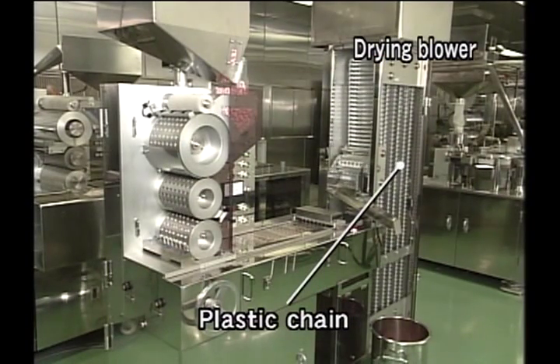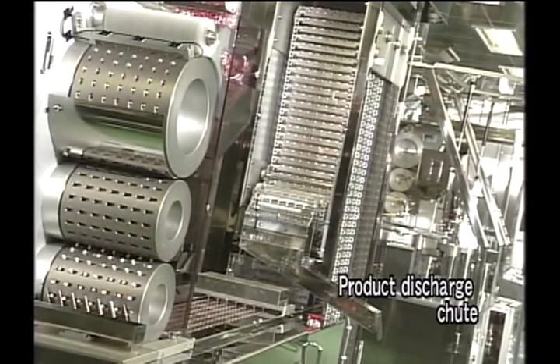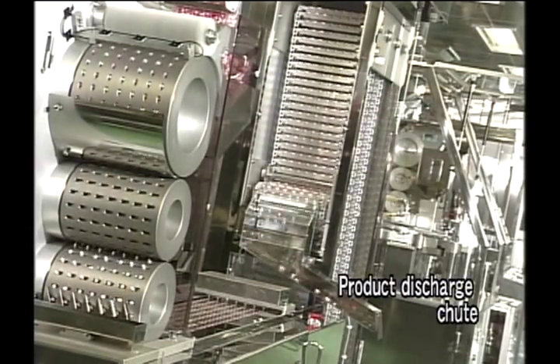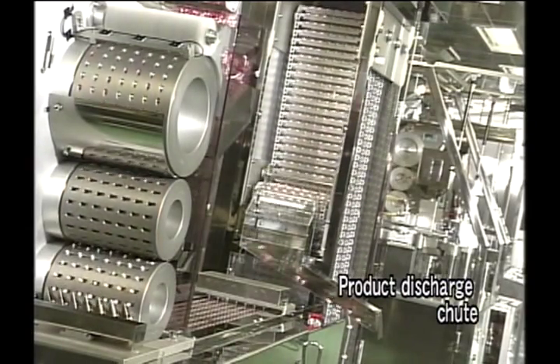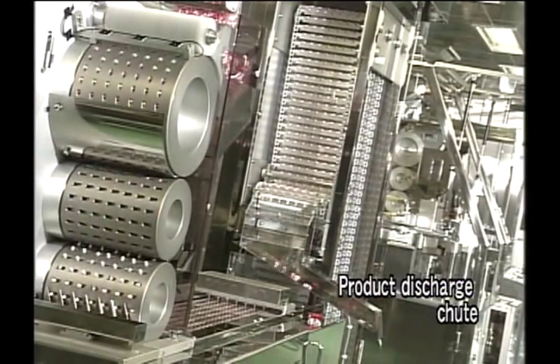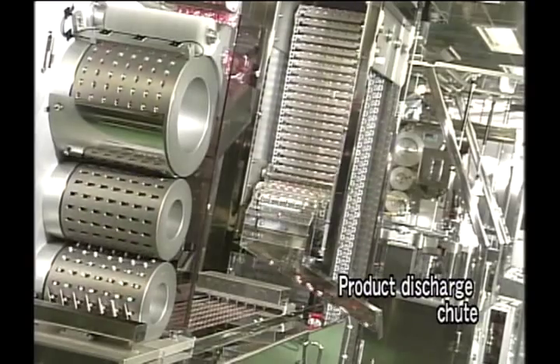This machine makes it possible to manufacture drug products that have a superior bioavailability. For example, by liquefying a lipophilic product or a product that is difficult to dissolve before using it to fill hard gelatin capsules. Also, we can fill and seal microactivated products after liquefying a low-concentration solution.